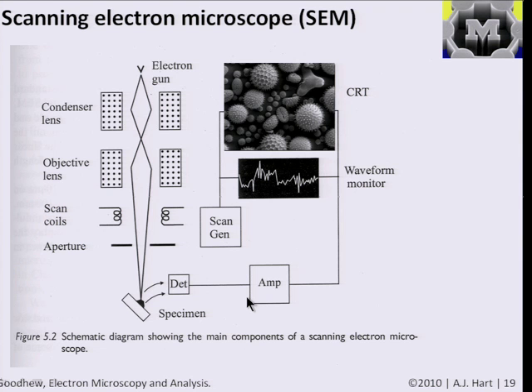So as we saw on the history plot, the resolution of electron microscopy has been around for decades, but it's been consistently getting better and better. However, the principle has always remained the same, and that's that instead of having a light source, a light bulb, you have an electron source, which is typically a filament of metal that emits electrons.